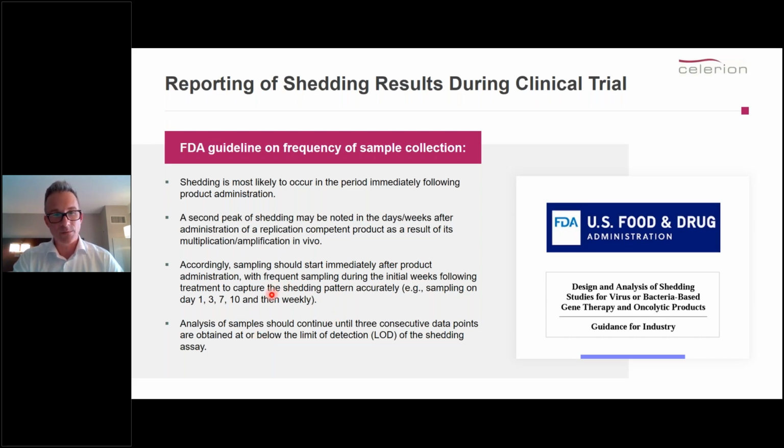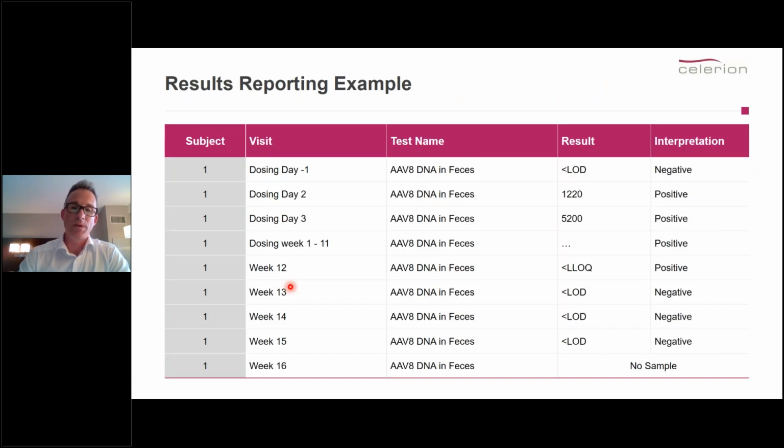Because you need to inform the clinic if the following week another sample should be taken, or if they can come off the contraception. And so it's not straightforward. You're not going to just get all your samples at once every 6 months, and then you run them and report the samples into a database. This has got unique requirements. So this has to be really carefully thought about when you set up your reporting structure and your sample analysis plan to be able to deliver that.